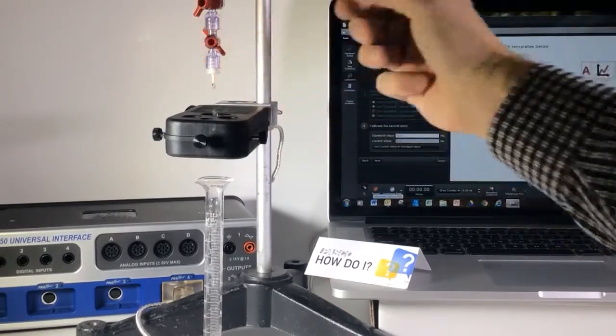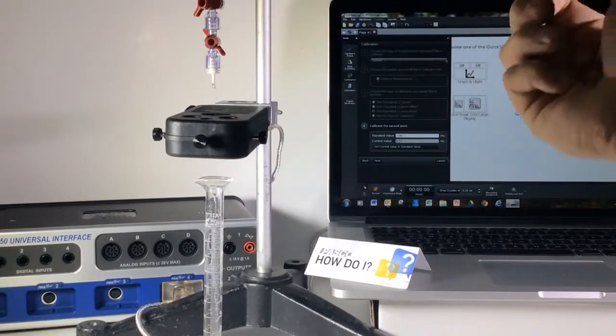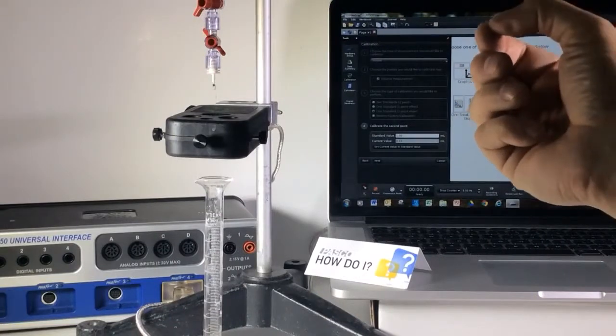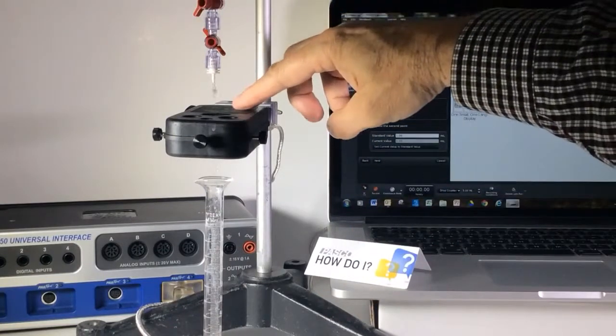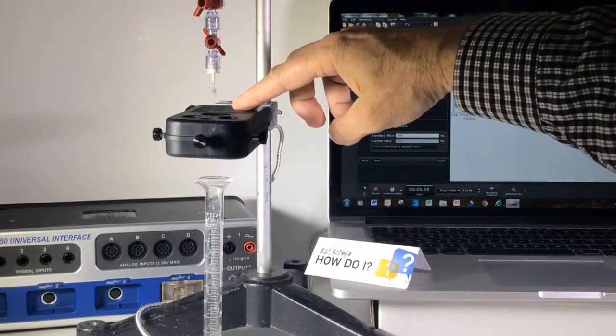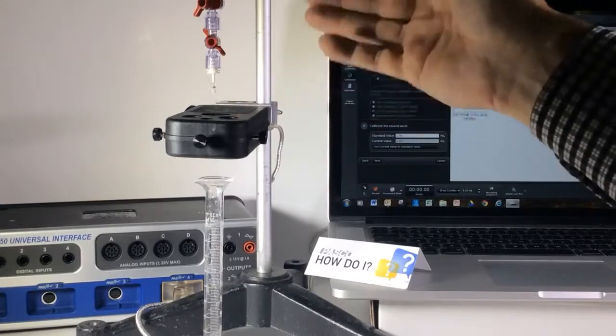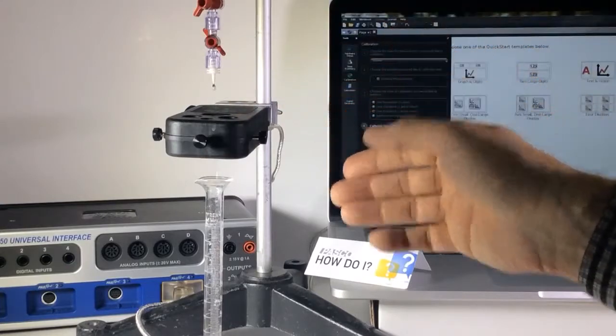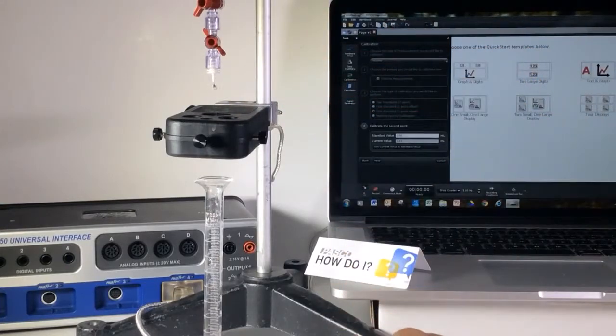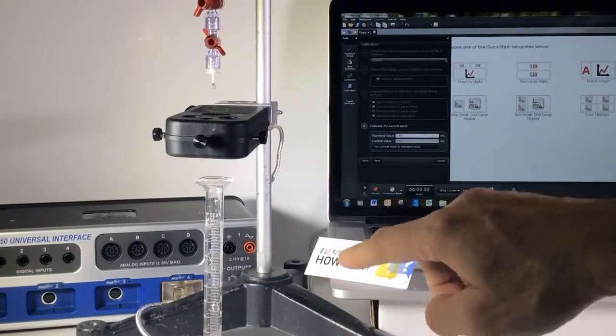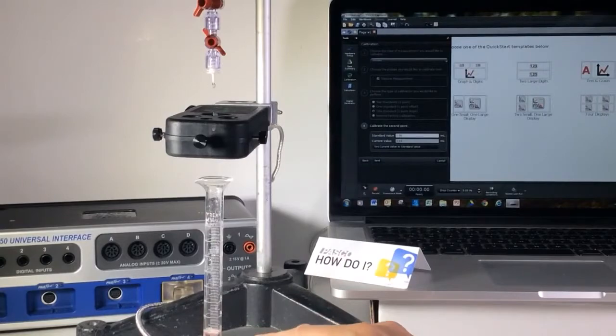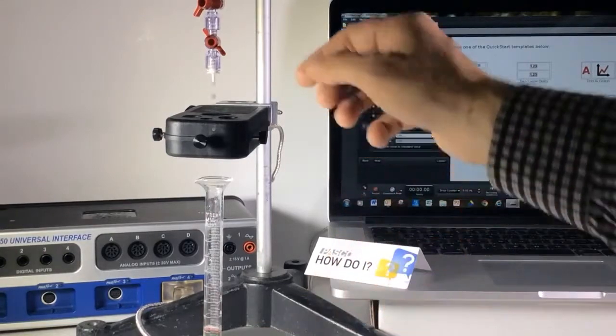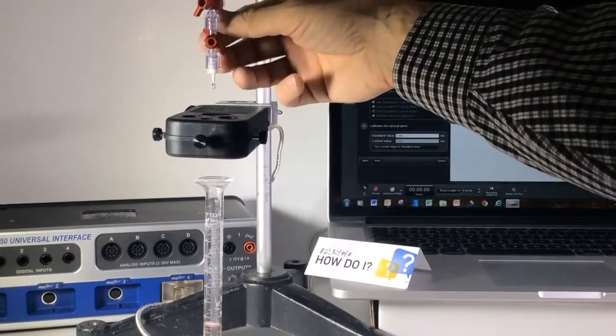I'm going to let a set volume drop through. I can see back here that the light is flashing, so I know that it is reading the drops. I'm going to let it go up to, oh let's say about 4.